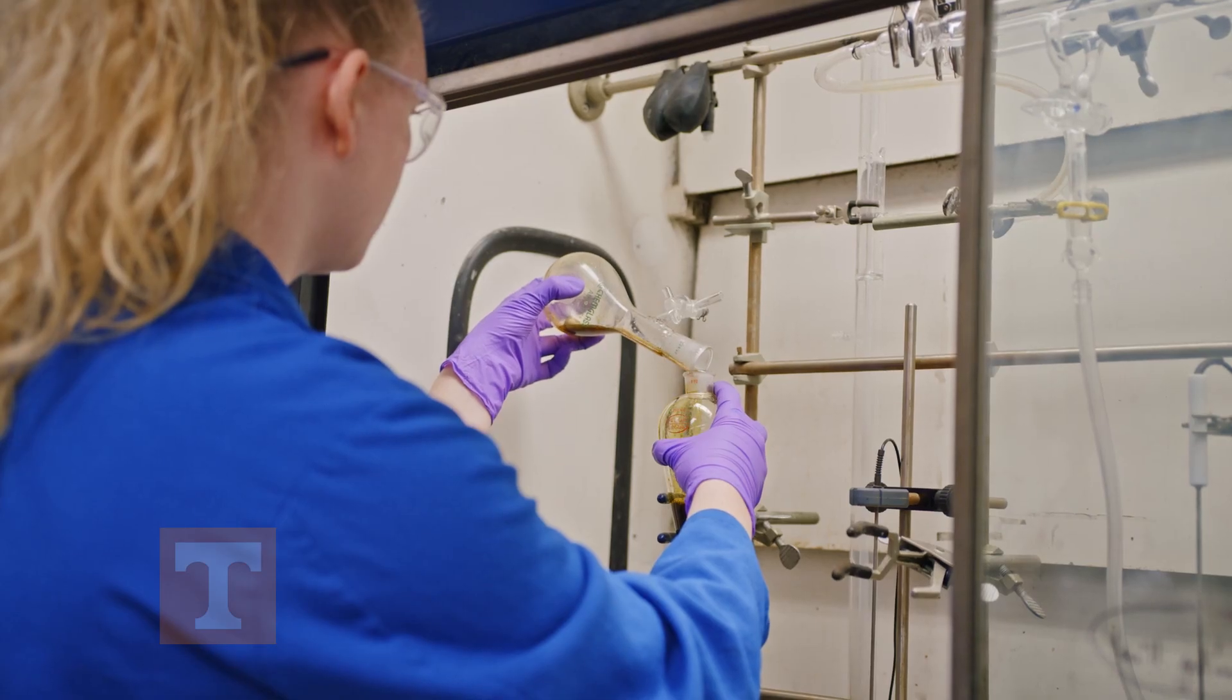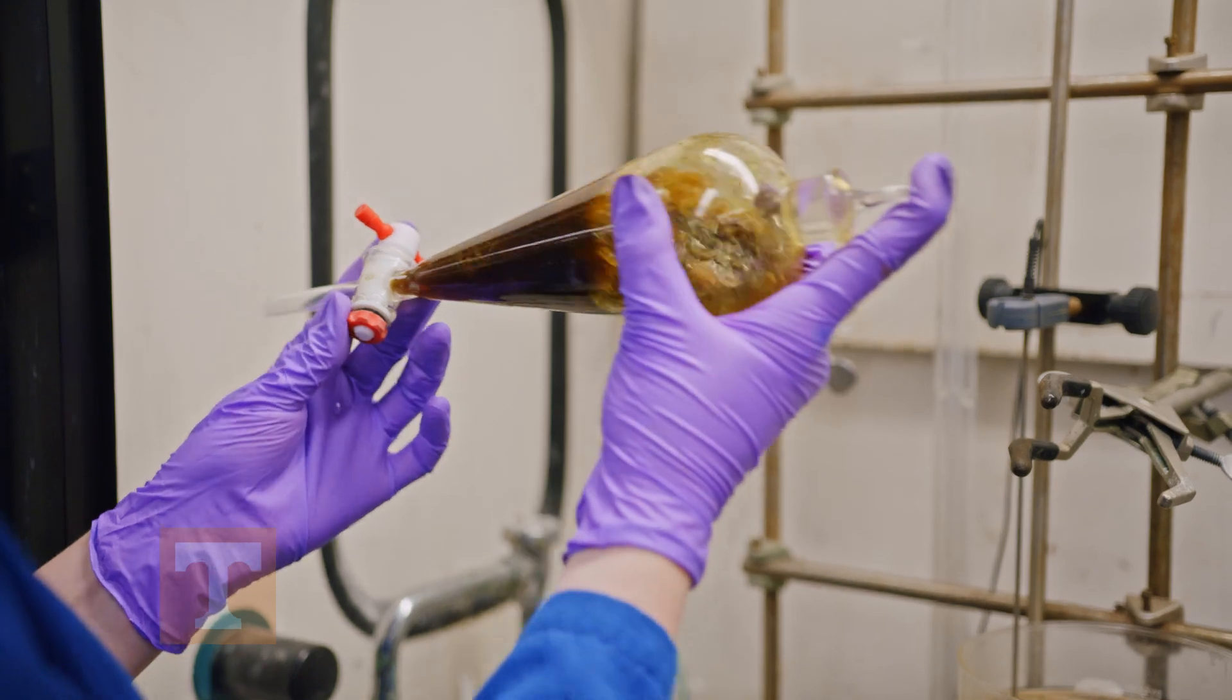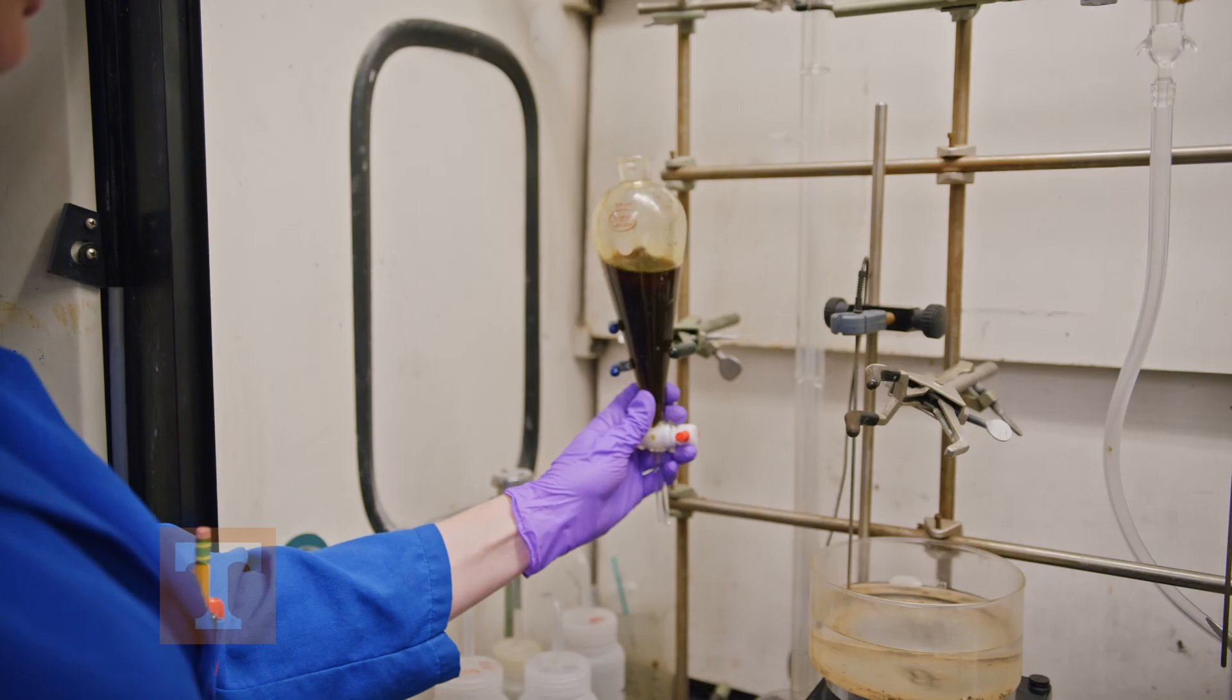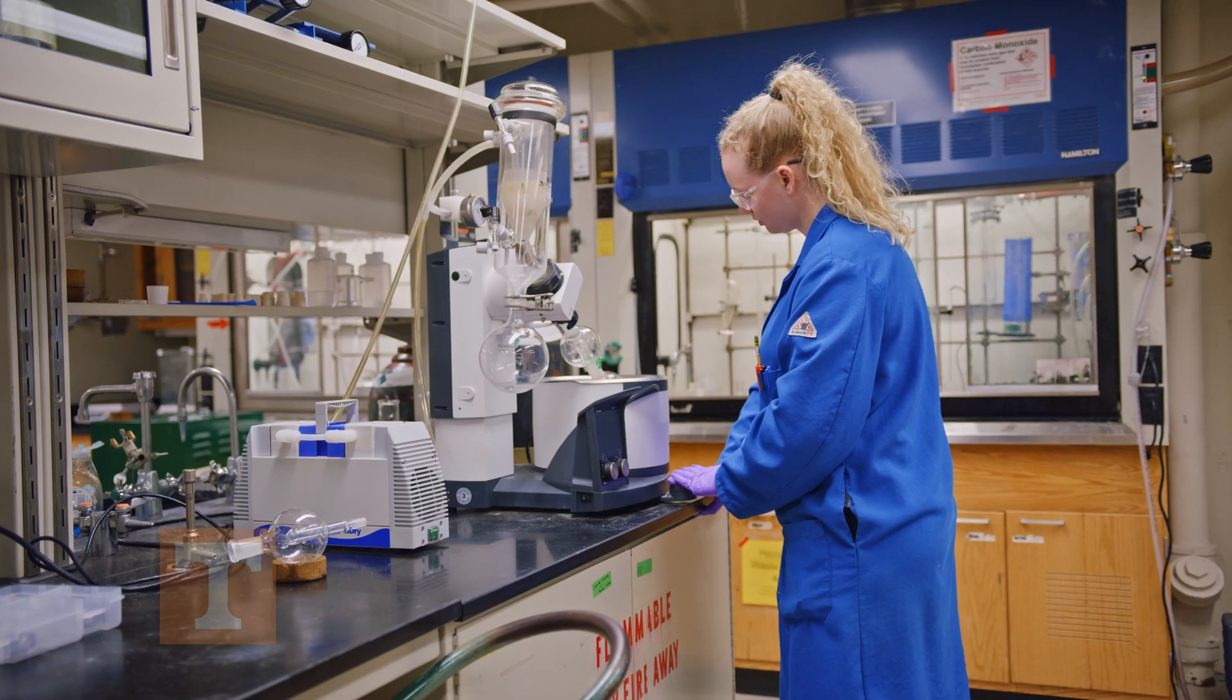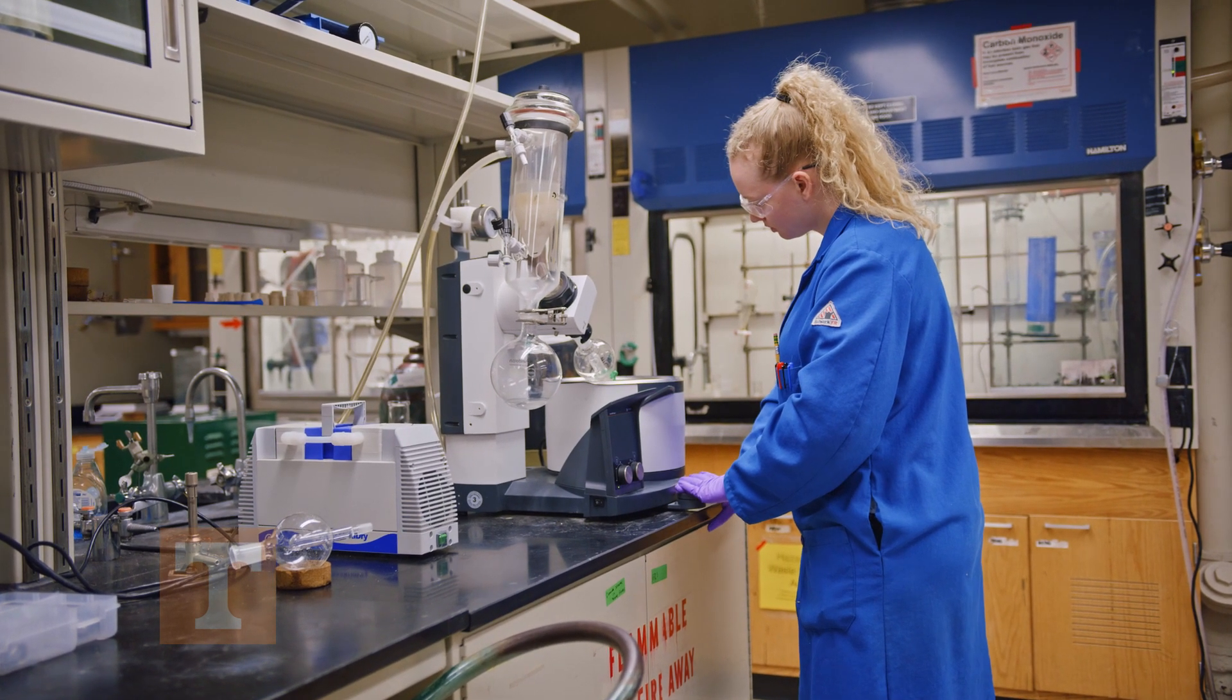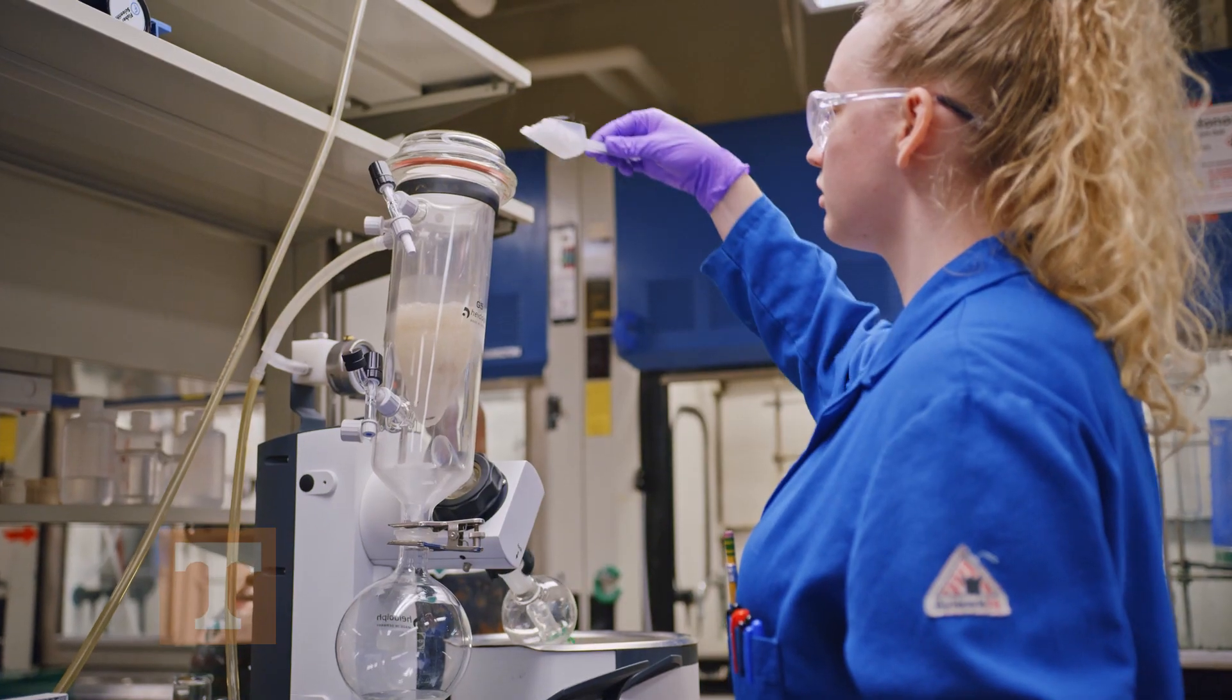The work also addresses biological problems like antibiotic discovery or developing new drug delivery systems. The Inorganic Division focuses on synthesis and characterization of both finite transition metal complexes and solid-state materials.